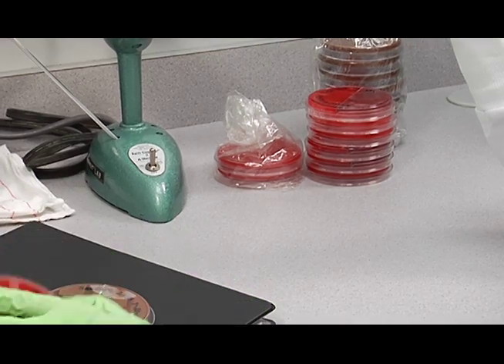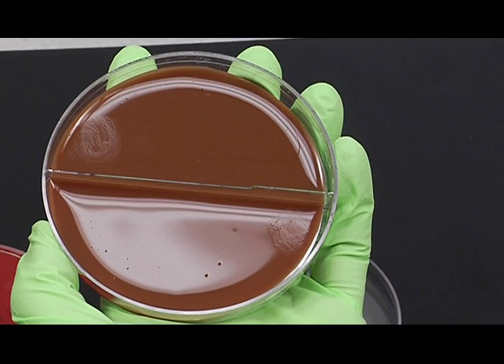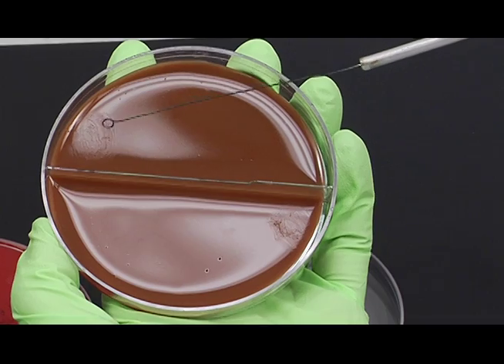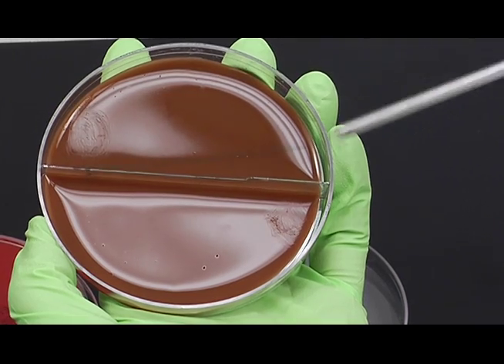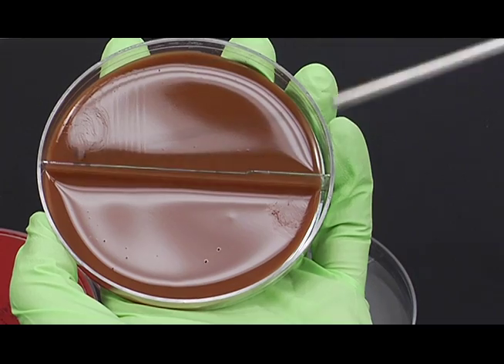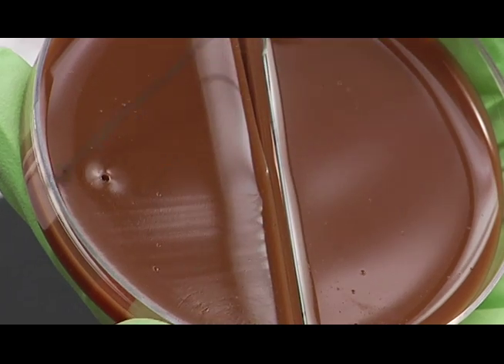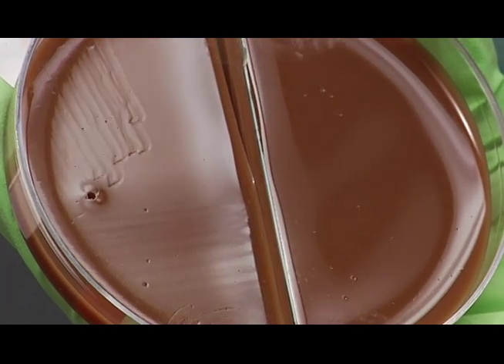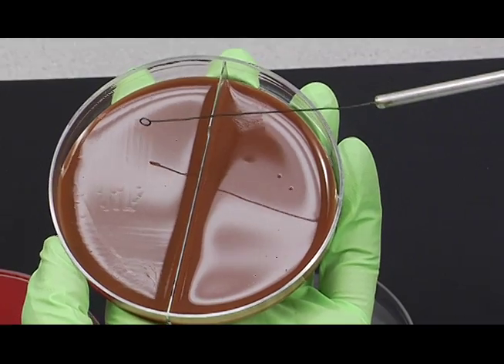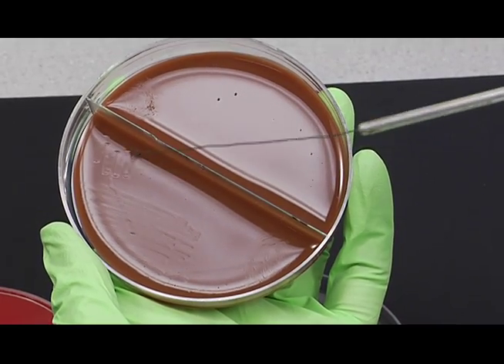After streaking the blood agar plate, we'll streak the chocolate agar plate, which is on this side. You can see the inoculum there. Flame your loop between the media, but not between areas on a particular medium. With a sterile loop, streak across that inoculum, then one swipe out into the plate area, and streak parallel to the divider, going out to the edge of the plate each time. Then take one swipe out from that area into the corner and streak it down.